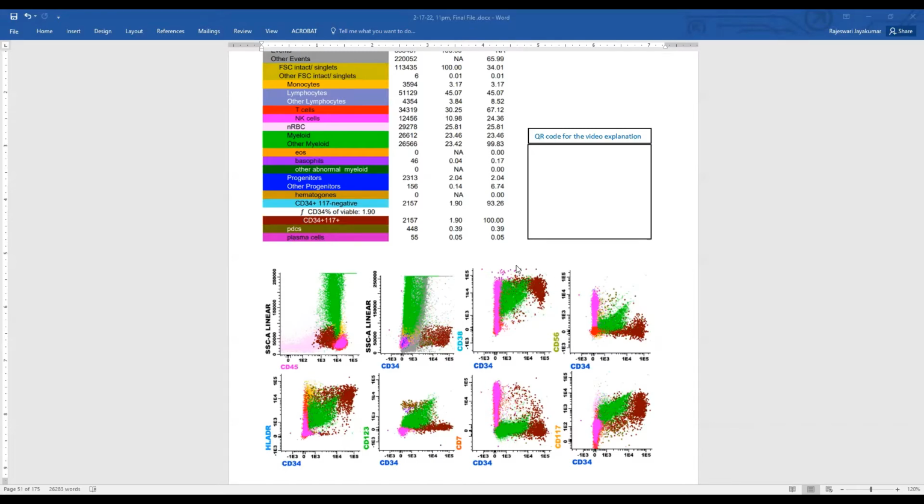They are positive for CD38. Normal blasts do have CD34 initially, and they're negative for CD38. Then they acquire CD38, and they slowly go this way, where they just have CD38 and lose CD34. So normally you'll see a pattern going from here all the way here. That is kind of a little bit missing, but again, we cannot say anything from that alone. We have to keep looking, but so far, that's one thing that is abnormal.